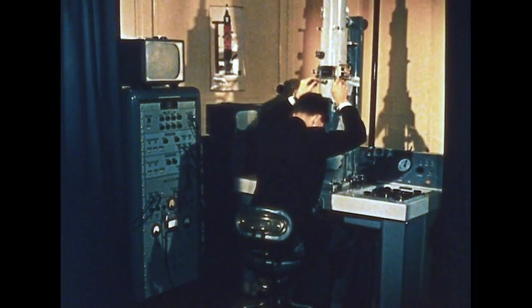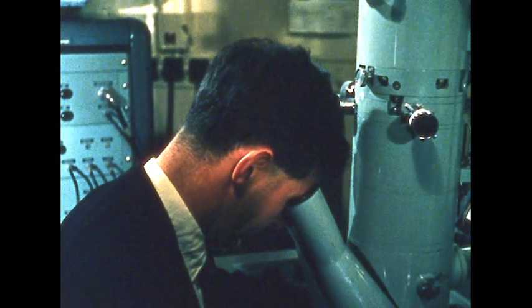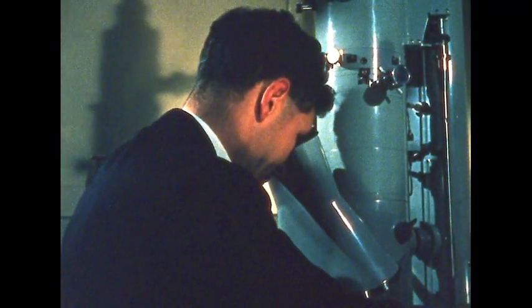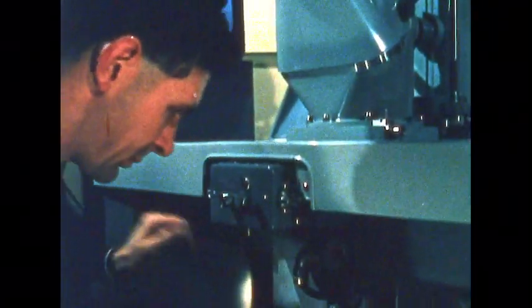A new improvement to the electron microscope projects the picture onto a television tube. A single bacterial cell is being examined. The electron beam falls directly onto an electronic camera tube below the viewing screen. This image intensifier increases the brightness level, allowing higher magnification or the use of lower electron intensities.